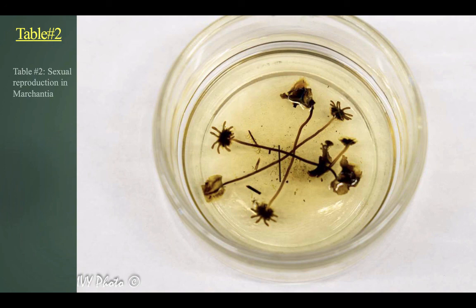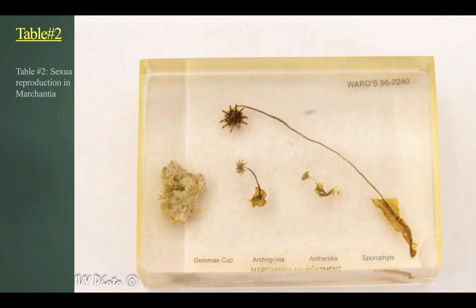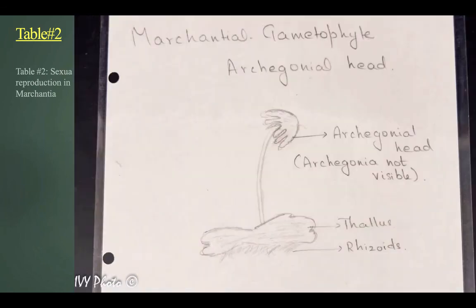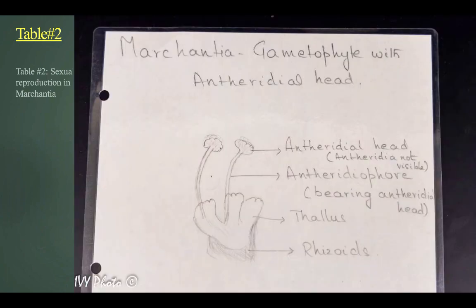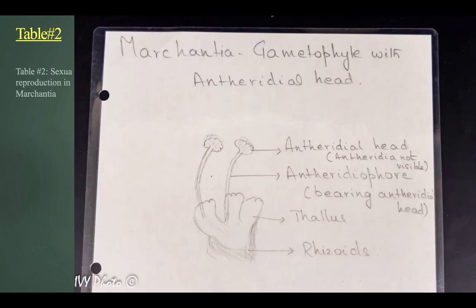of the, you know, you can look at that and go, is that female or male? And here is the other that can kind of help. I think that's probably one of the better ones, though, to help you there. And so they also have pictures and drawings to help you with that. And you can also go back to some of my old ones. And then you can see the small stuff coming out that is essentially looking at the smaller ones you're going to look at are the spores.